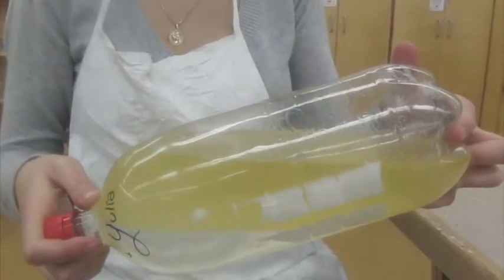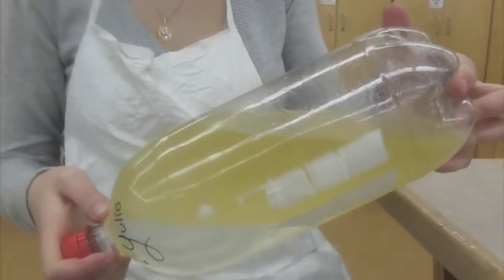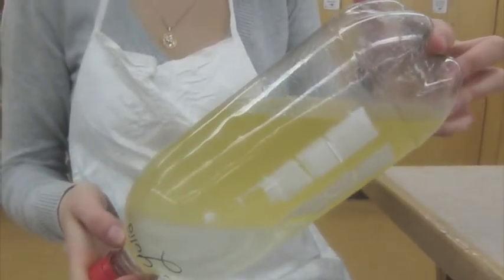Step 9: Measure 250 ml of water in the smaller beaker and carefully pour it into the bottle. Place the lid on the bottle. Step 10: Slowly and carefully rotate the bottle, turning it upside down and then back up. Let the mixture rest for 10 minutes.